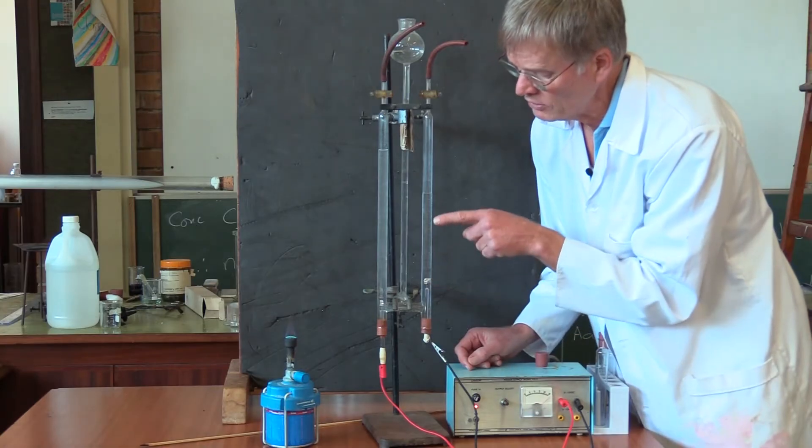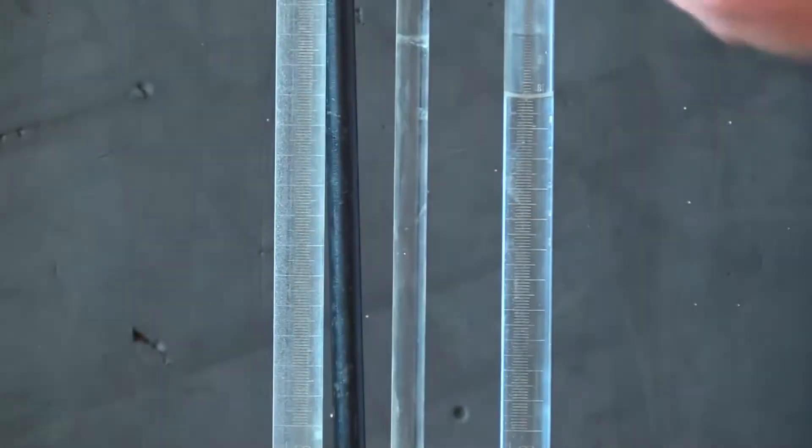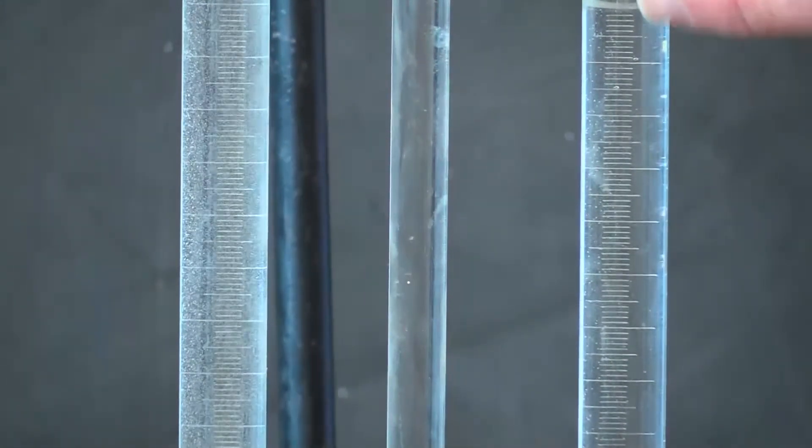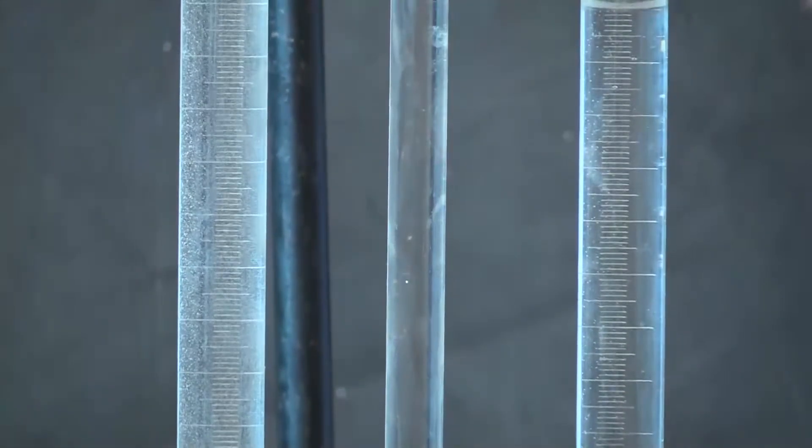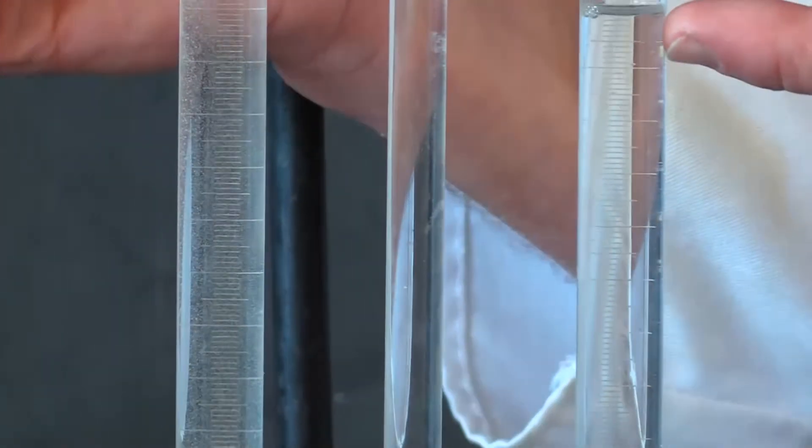And you can see bubbles bubbling up in these two tubes. Now the tubes are there specifically to collect the gases separately. So let's have a look where the gas levels are at the moment.